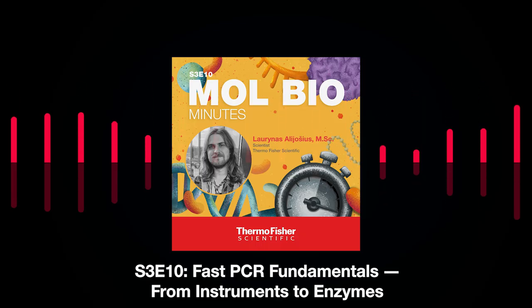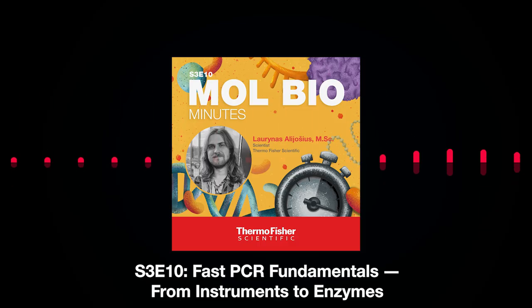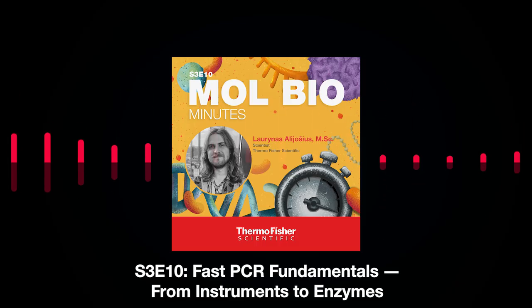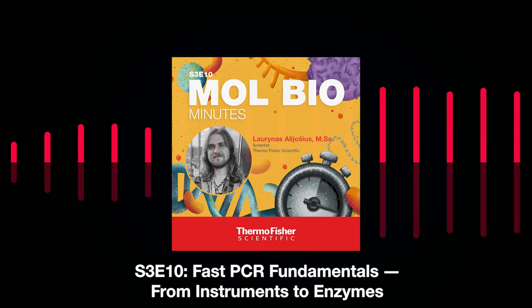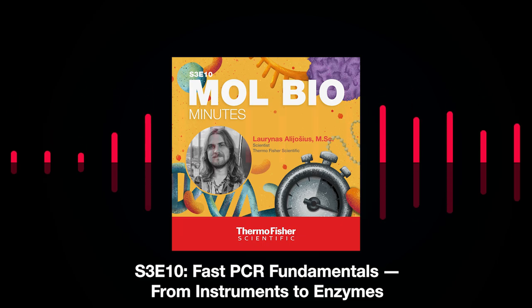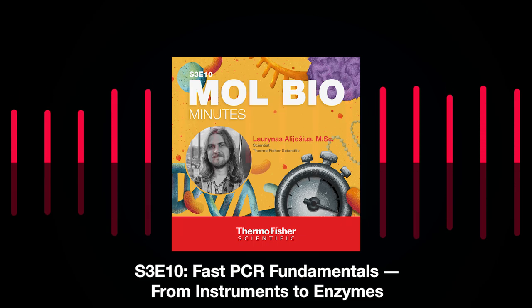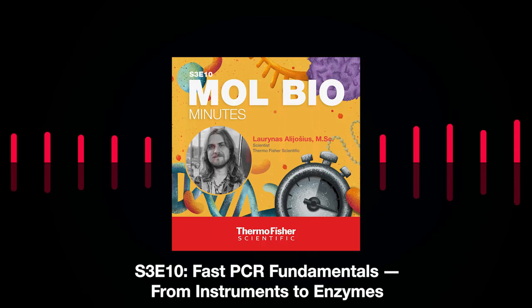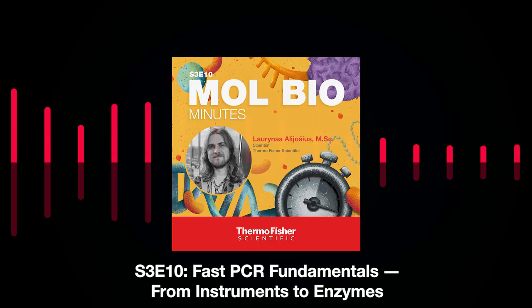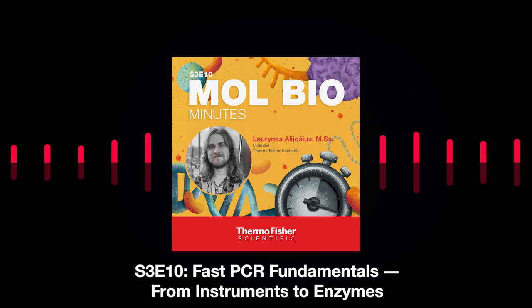And how it's possible is that long primers have higher melting temperatures, and higher melting temperatures allow you to perform the annealing step of the PCR at a higher temperature, and you can even try to join the annealing and elongation step together to be performed at the same time.